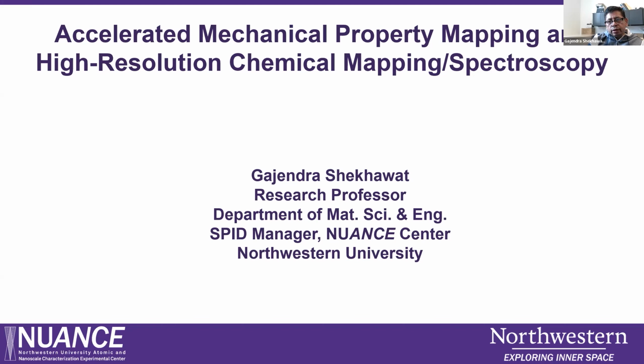And then the second technique is mostly about the integration of an AFM and Raman system along with scattering near-field optical microscopy. So I will cover some basic fundamentals, and I will also discuss some of the applications of these techniques and the different components that we are getting.